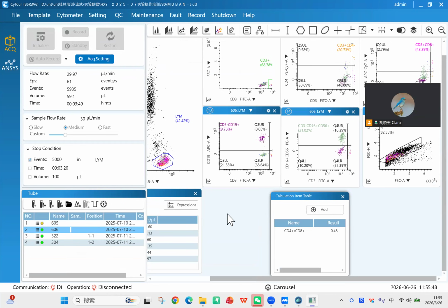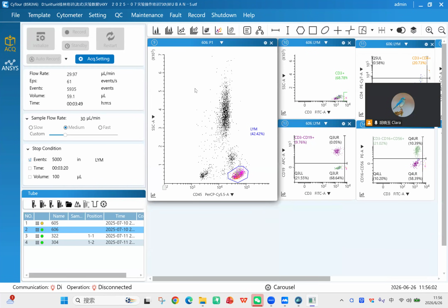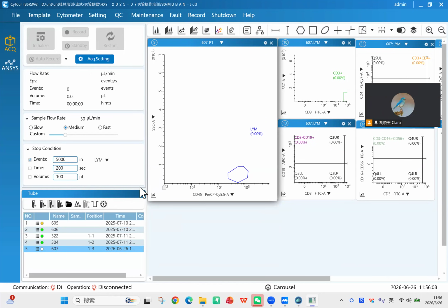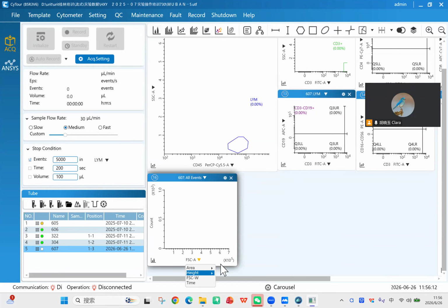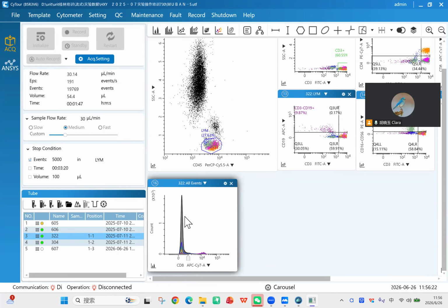Okay, this one already gets the information. Okay. For example, add tube. Add these tubes, and then I want to add the plots. This one here. It will have the data here, and normally we use the input side.